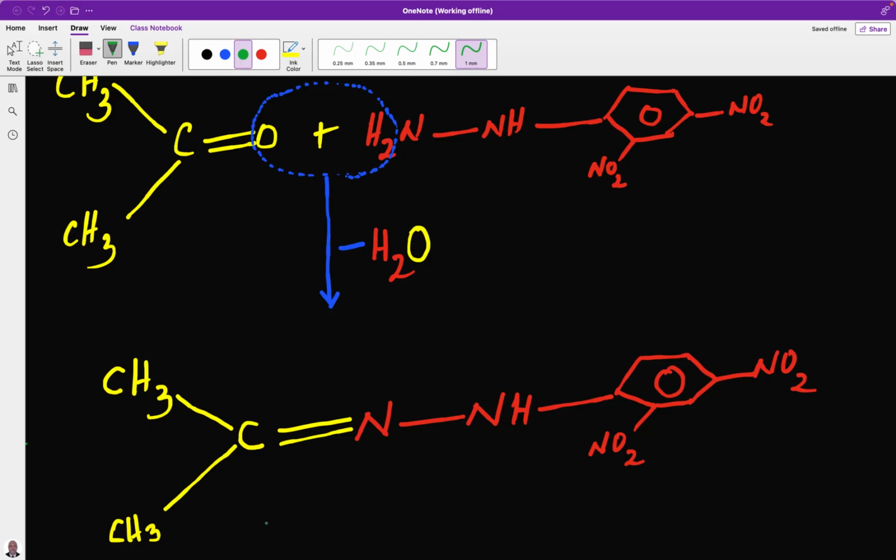You can say acetone or propanone. Let me use acetone. Acetone 2,4 what?